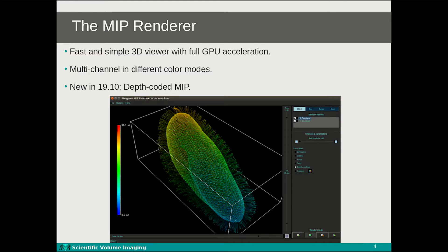Here we can see the actual MIP renderer tool. In this tool you can interactively rotate, pan and zoom your object with the mouse. Individual channels can be turned on and off and each channel can be given its own color. In the bottom right you can see an option called render mode, which sets the quality of the rendering. Setting the quality to high will make the renderings look better, whereas low quality mode will make the rendering process faster.